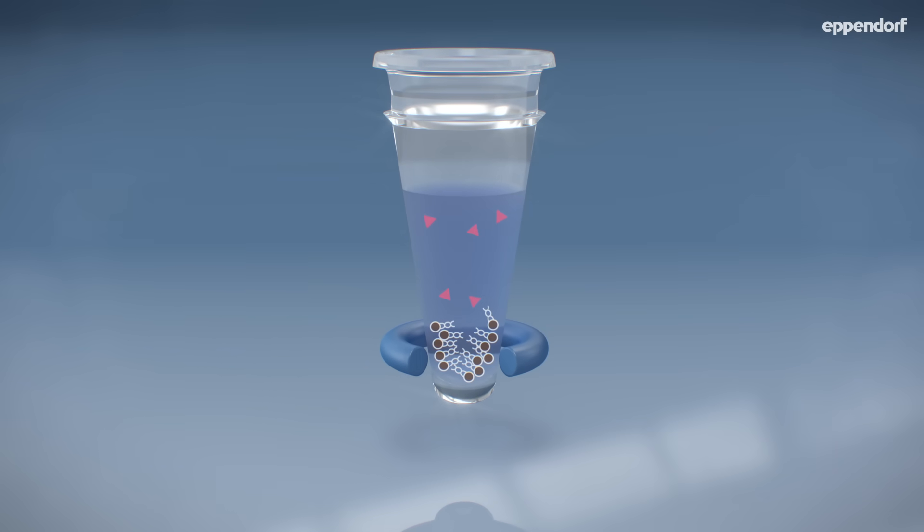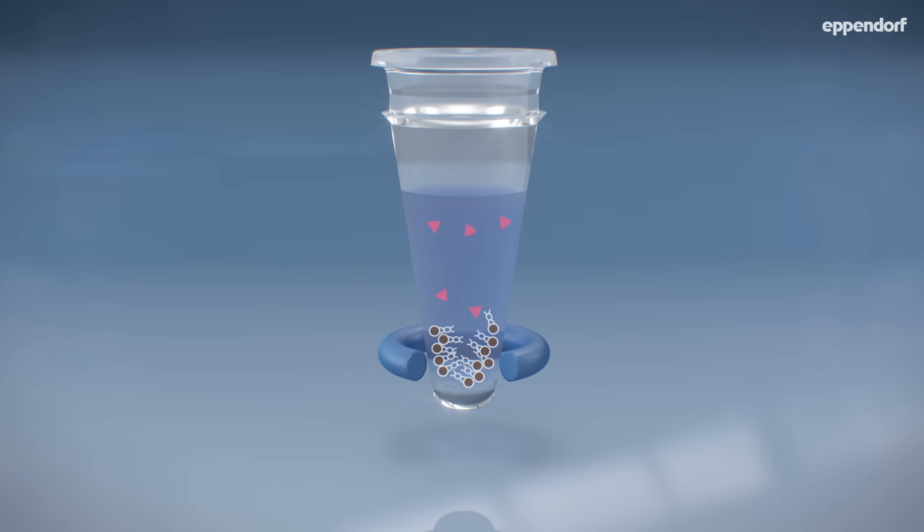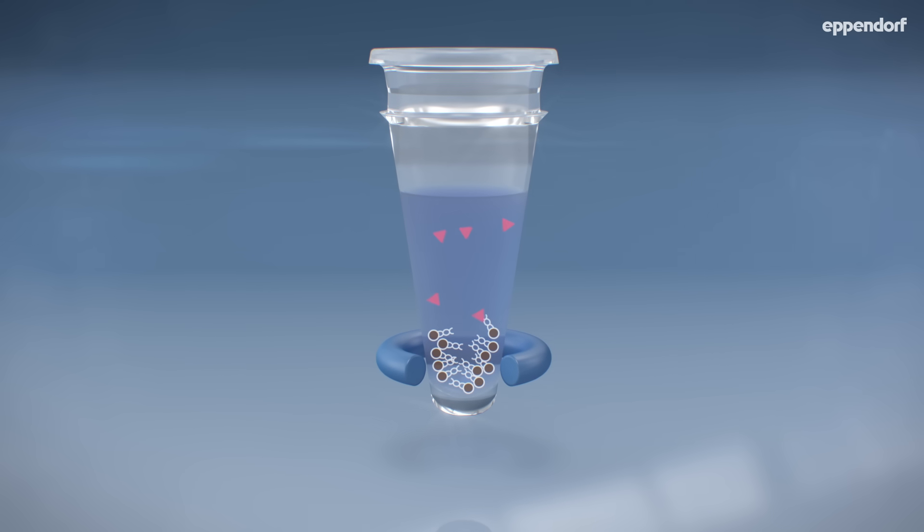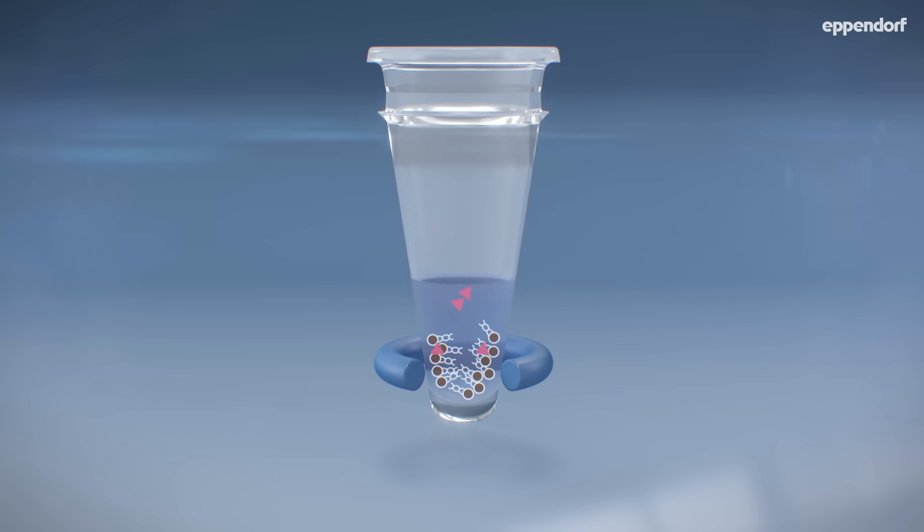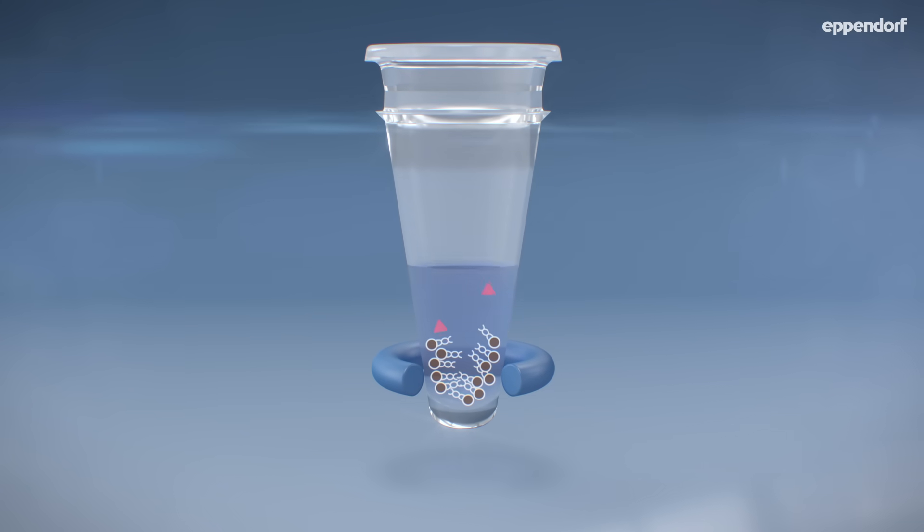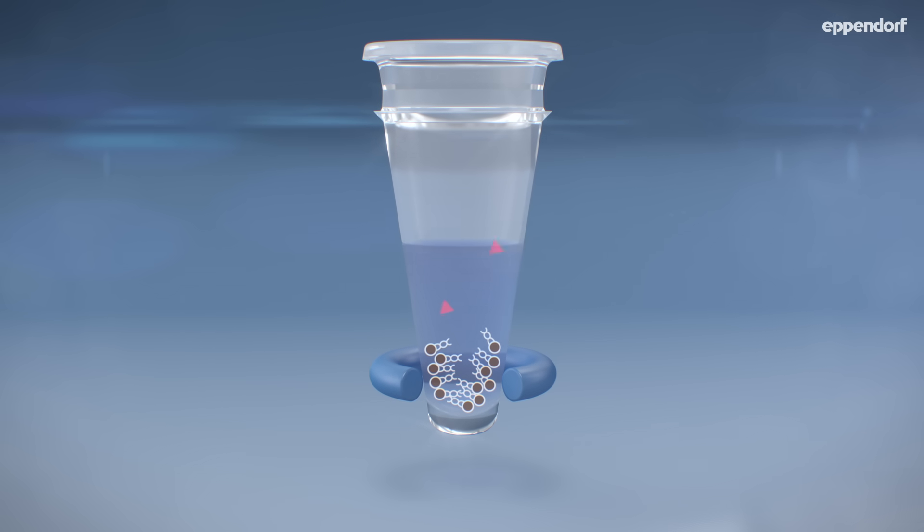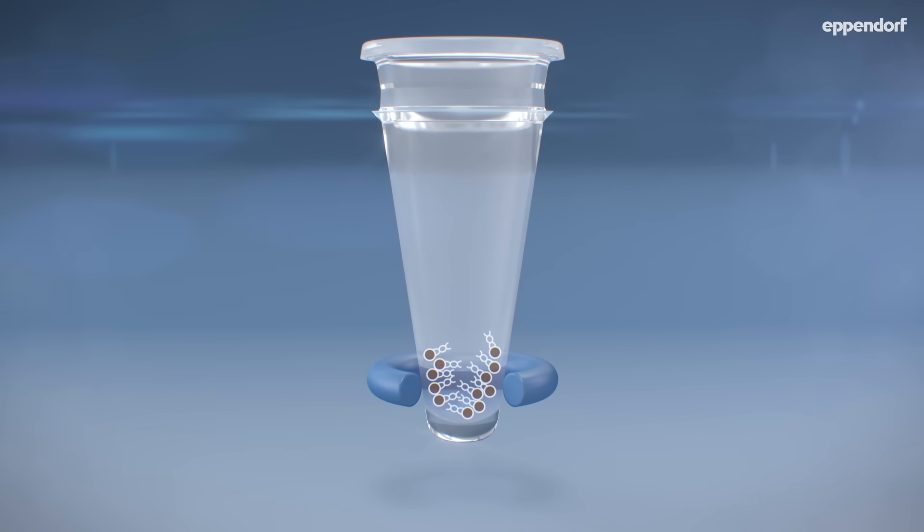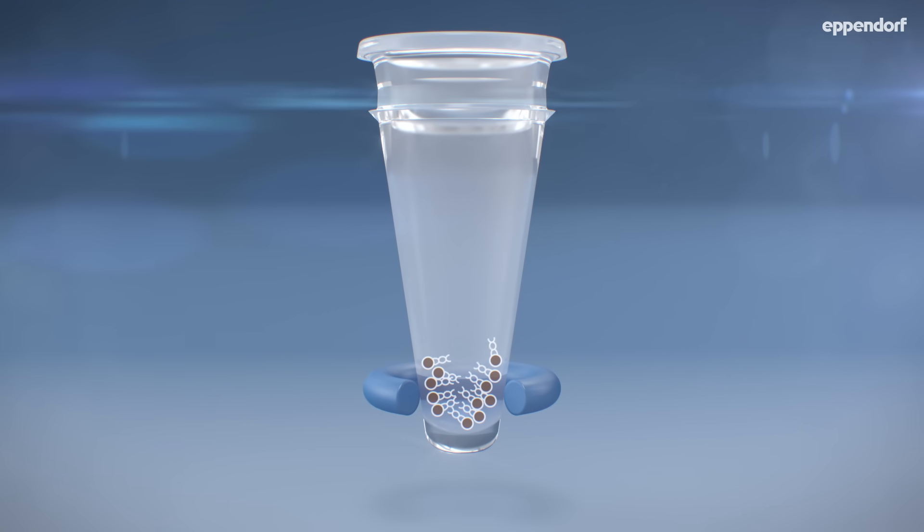With the sample plate still on the magnet, the next step is the ethanol wash. First, the supernatant is removed. The ethanol is added to the pelleted sample and removed. The pellet will then have to dry, to remove any remaining ethanol.